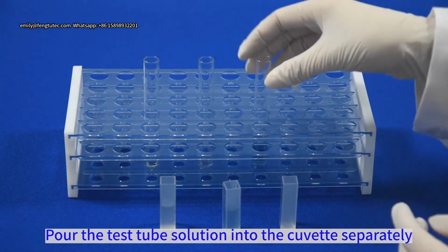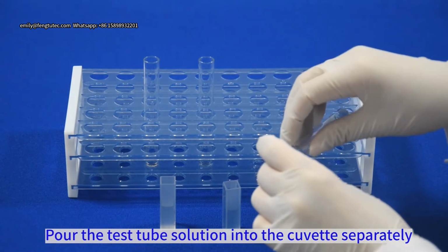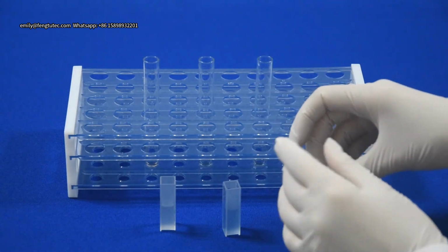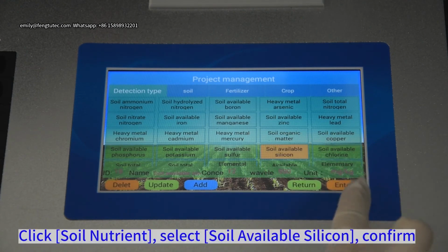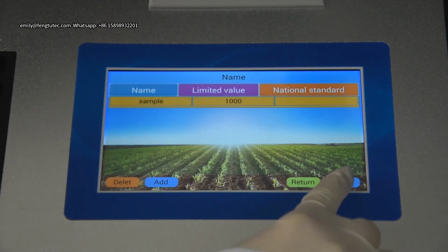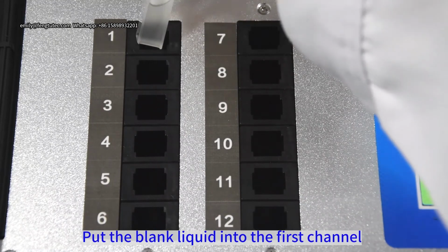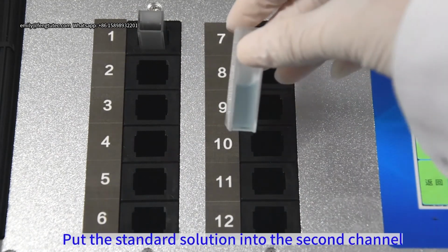Pipette blank solution into the first test tube. Pipette standard solution into the second test tube. Pipette 0.5 ml test solution and 1.5 ml extract into the third test tube.